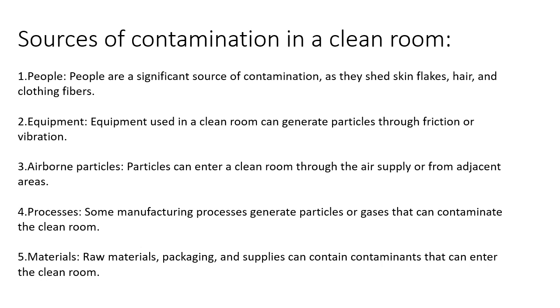You cannot just enter a clean room in your street clothes, right? We have to wear designated clean room garments. So the clothing fibers are also a source of contamination. That's the reason why the first very important source of contamination considered in a clean room is people.